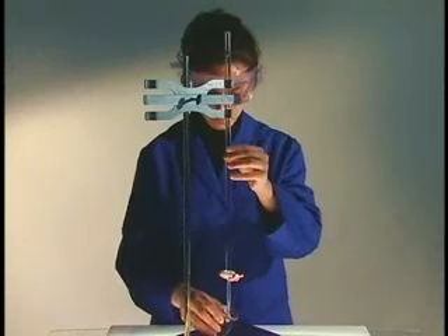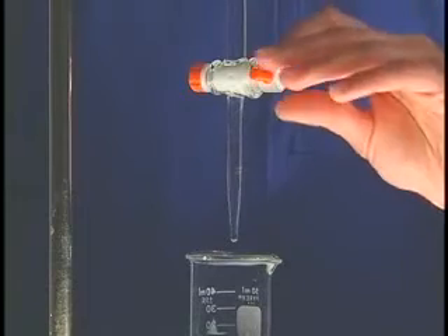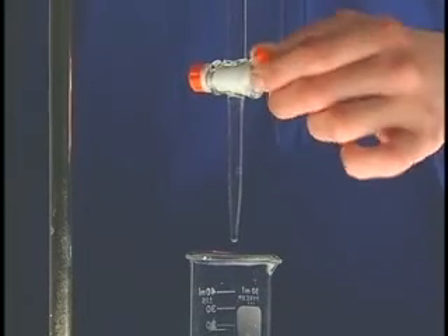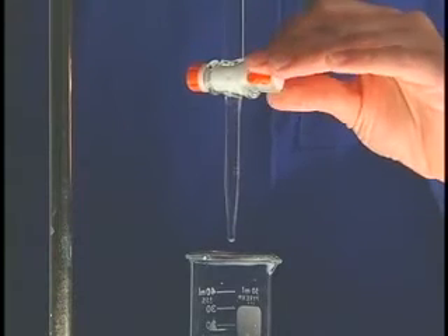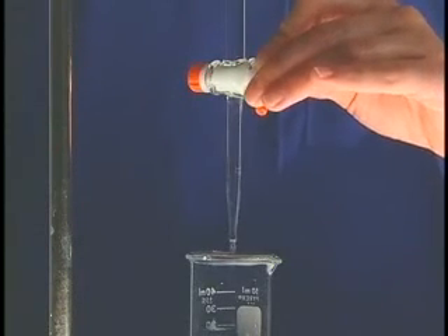The stopcock controls the amount of solution delivered by the burette. When the stopcock lies horizontal, it is in the off position. When the stopcock is placed vertically, solution will dispense at the maximum flow rate. Intermediate flow rates are achieved by positioning the handle between these two extremes.